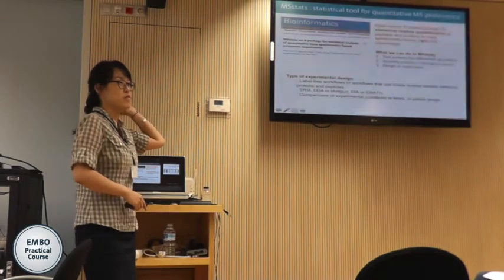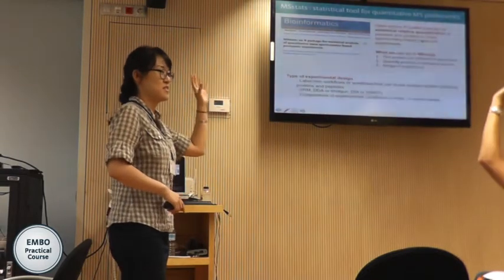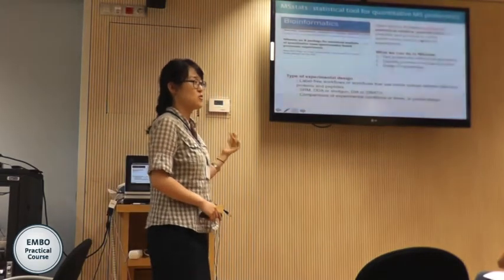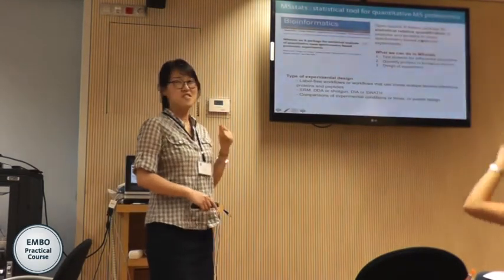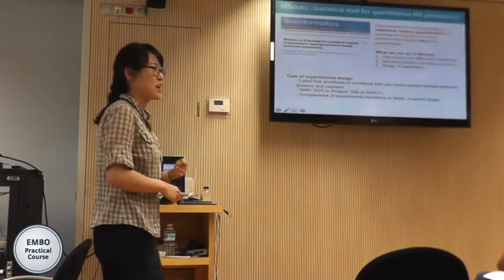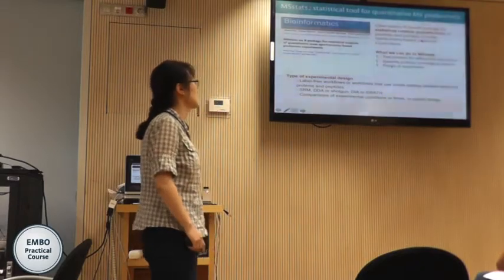So how many people have heard about MSstats before? Oh, pretty nice, quite a lot. How many people already started to use MSstats? Oh yes, great. Okay, so I hope that we have more users of MSstats in the future.